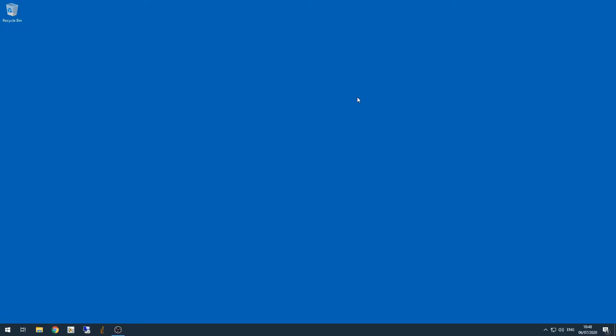So after you've physically connected all the PI controllers to your computer, the first thing you want to do is run PI MicroMove, which is the software that ships with the stages. You can think of PI MicroMove as a one-stop shop for PI stage control. PI MicroMove also lets you easily reference all the stage axes, which you definitely want to do before you begin.